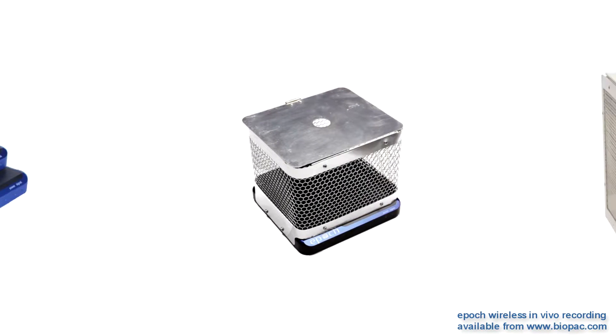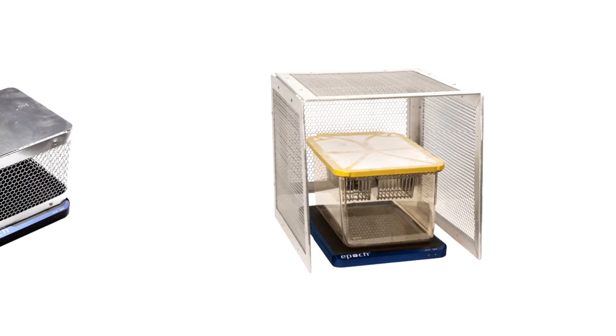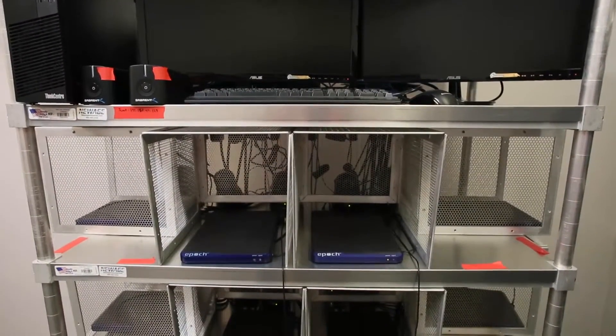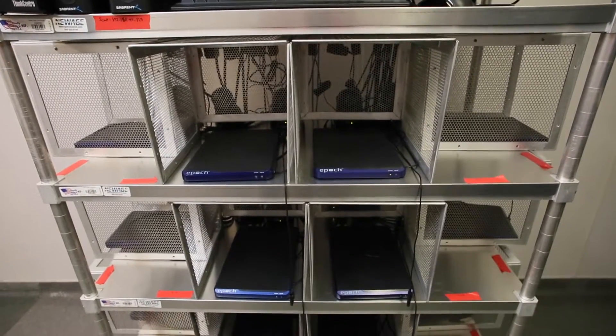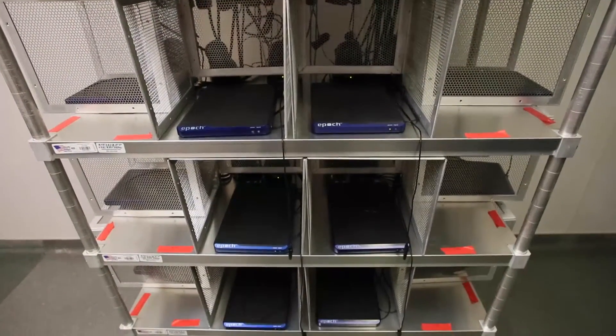Receivers are available in 3 sizes, compatible with industry standard rodent caging systems, and are scalable from one receiver to high-throughput parallel recordings from multiple animals. There is no crosstalk between cages.